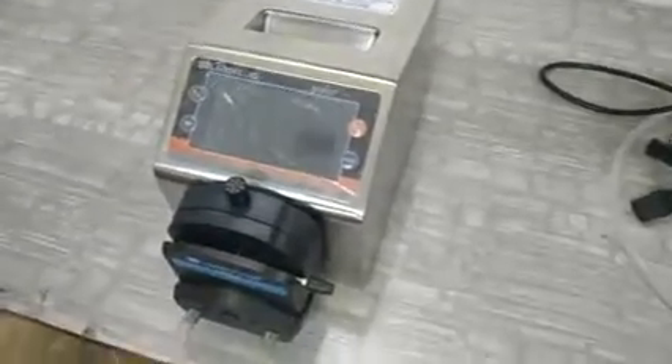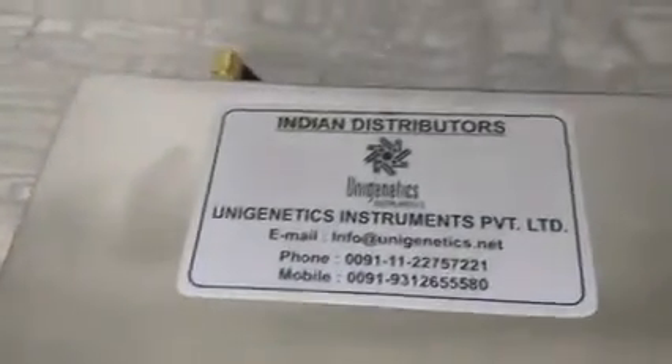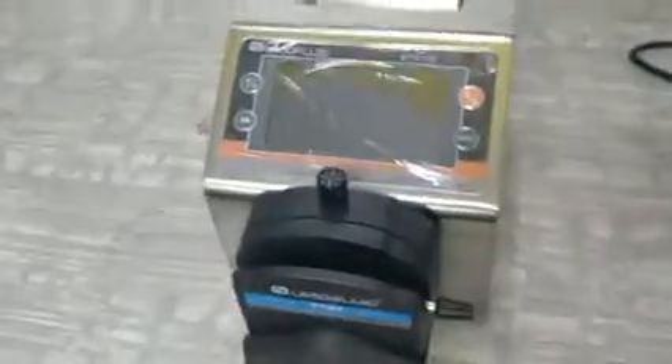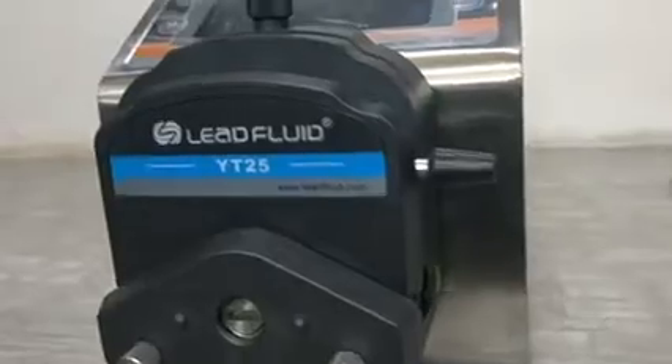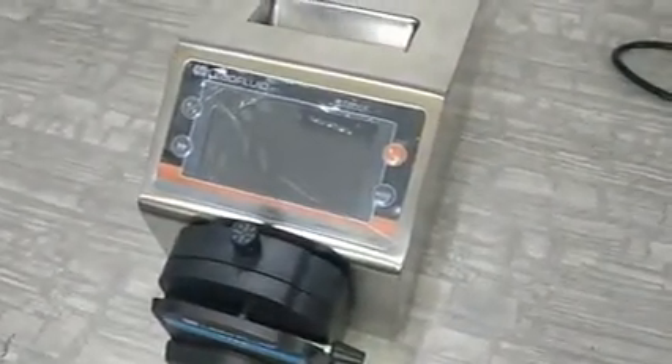Dear customer, we thank you for purchasing the Lead Fluid peristaltic pump. Uni Genetics Instruments is representing Lead Fluid in India for the last four years, and as of January 2021 we have around 60 installations in India. These pumps are quite rugged and the performance is excellent — that is the feedback we have received from our customers.